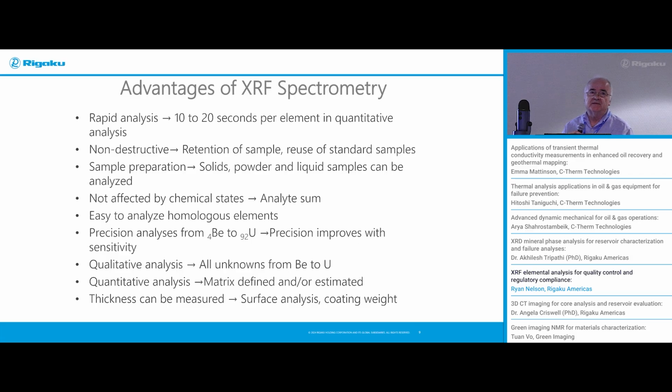So the empirical setup is whatever values you put in, you'll generate a plotted line. And FP will use automated FP corrections and influence coefficient corrections. And you'll end up also with very accurate analysis. And also thickness can be measured in most machines, usually up to about 10 layers from those products.